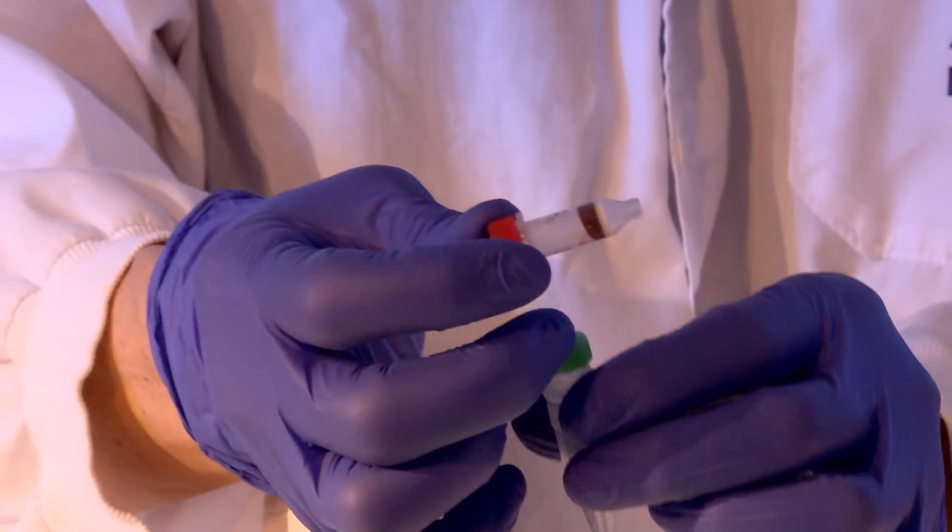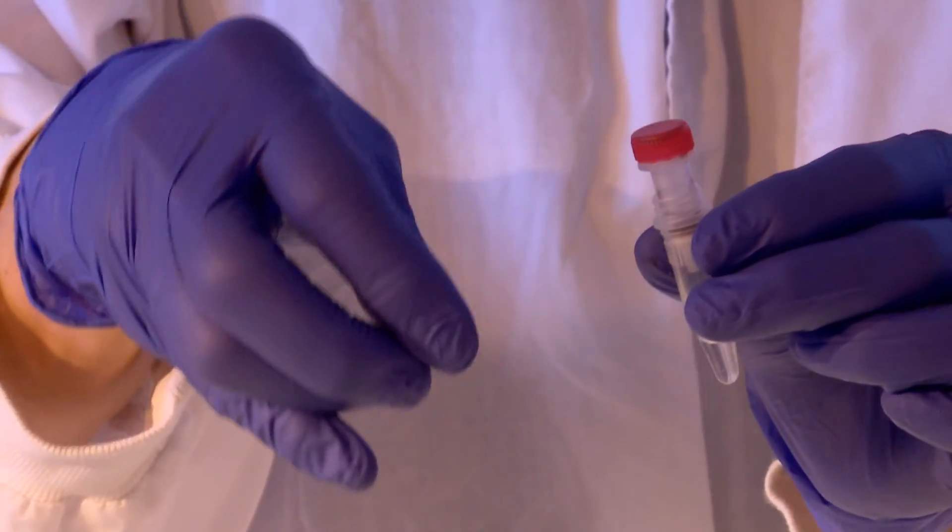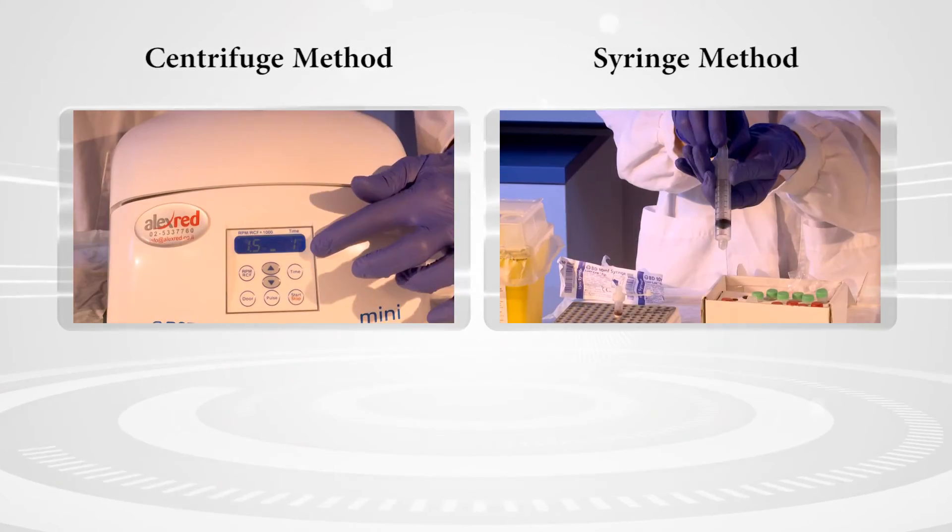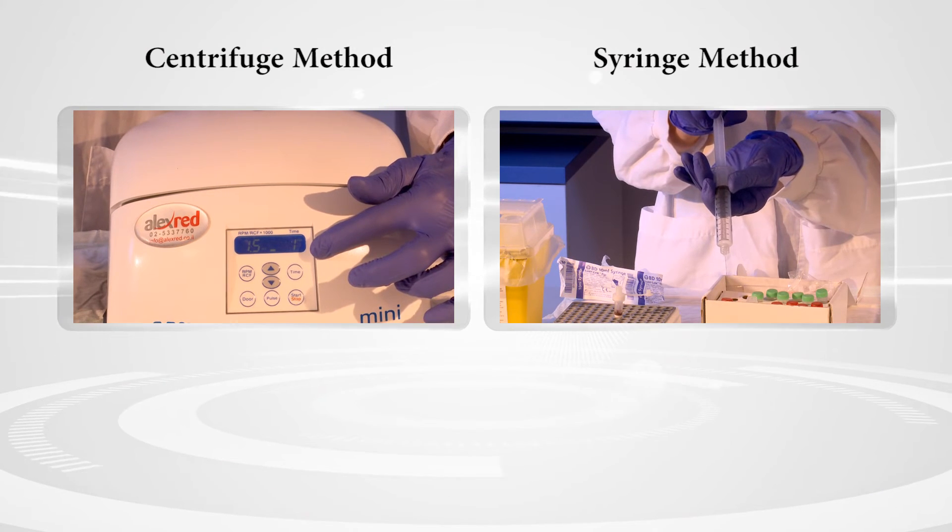Gently place the column into the 1.5-milliliter green-lid collection vial containing PC-run dilution buffer. The DNA can be displaced into the PC-run dilution buffer by either of the two methods described below.